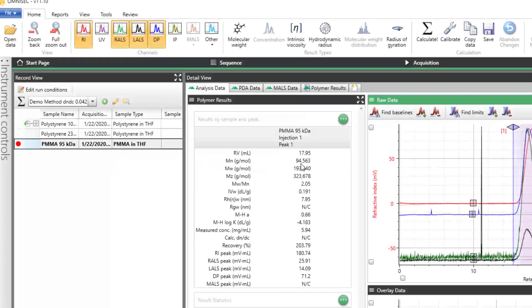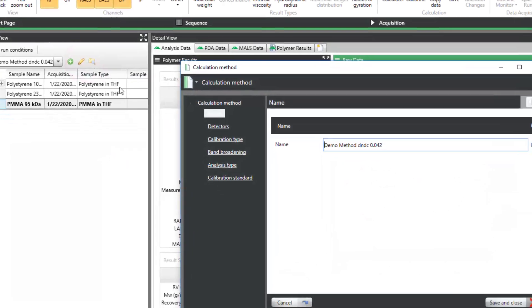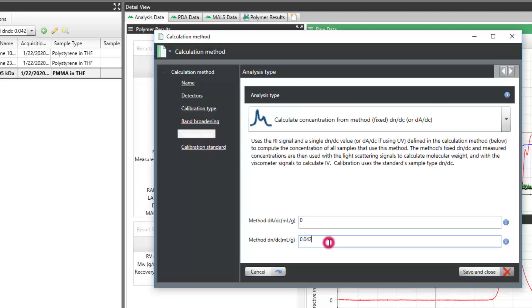To change the DNDC value for the method, click the Edit Method icon, set the new method DNDC, update the method name, and click Save.